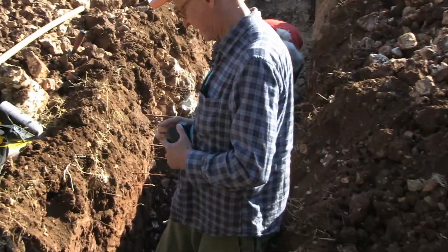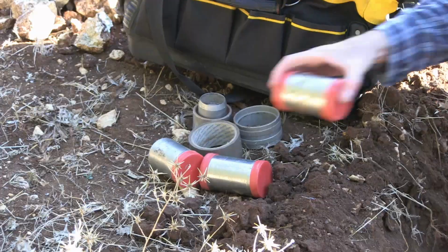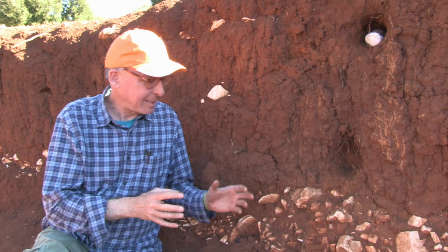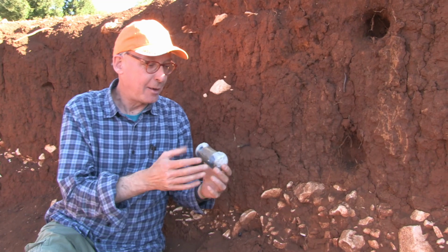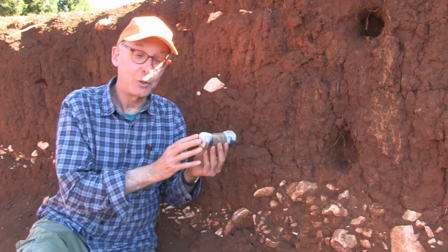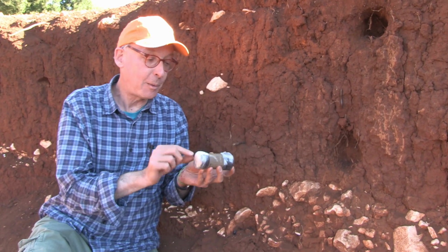We can date things which have been exposed to daylight, and then as the grain becomes buried, it will absorb dose over time, and we can collect the sample in tubes. So this is one I collected earlier, and I've wrapped it up. And we have to make sure we shield it from light while we do the sample collection. So we're using black PVC tubing with rubber caps.